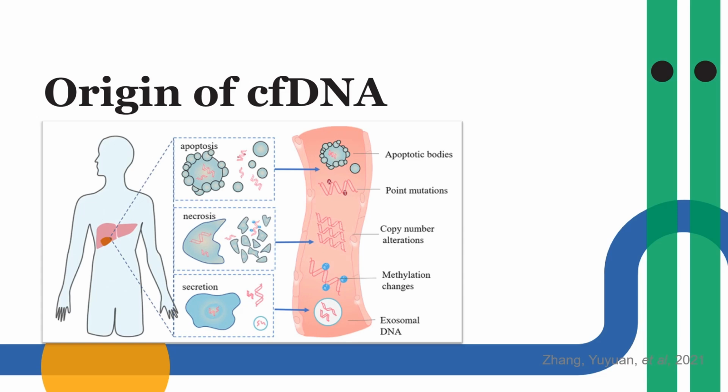Tumor-associated DNA is primarily derived from apoptosis of primary, metastatic, and circulating tumor cells, CTCs, as well as active release from proliferative tumor cells, which is known as circulating tumor DNA, ctDNA. In general, ctDNA only accounts for a small fraction of the total cfDNA, and there is no way to isolate ctDNA, especially from other cfDNA.